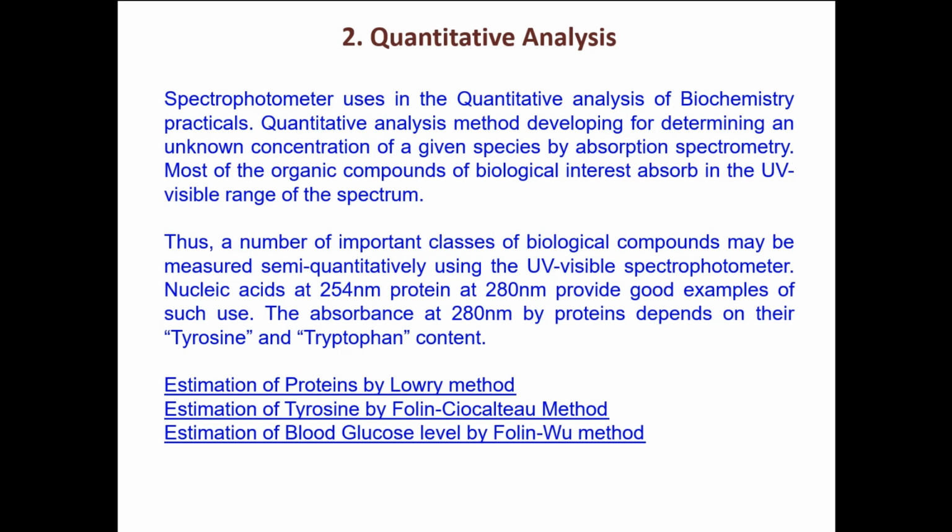So you'll go for a procedure: you will take the bacterial cells, and the bacterial cells will be lysed, and then we'll go for the extraction of DNA, and finally the DNA will be precipitated, and the precipitated DNA will be dissolved in water or TE buffer or whatever it is. So once we have done that, then you have to quantify it. What is the amount of DNA present in the sample?